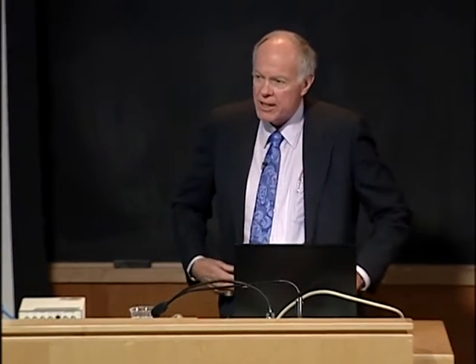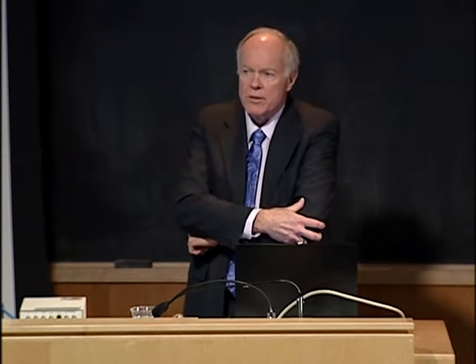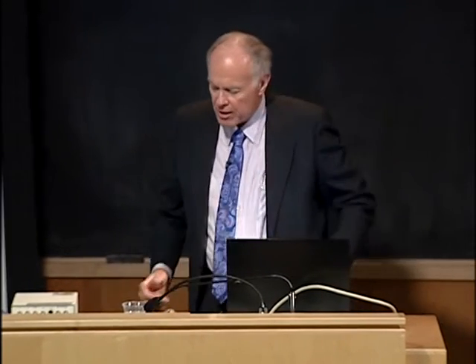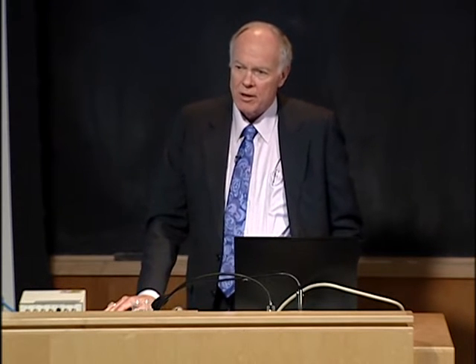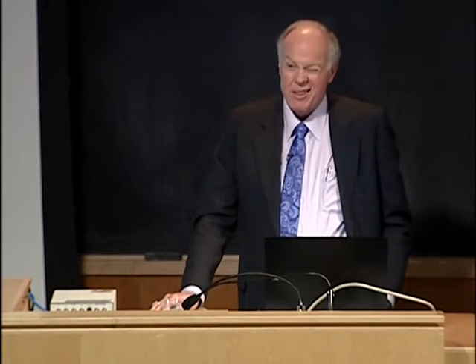This is what we want to talk about today. I was asked to talk about future laboratory automation, so I'm not going to show videos or photographs or slides about ARUP's existing automation. If you want to see that, there's a tremendous amount of information about it on our website, www.ARUPLAB.com. You have to do a little searching under technical expertise and then automation and you'll find it. There are a lot of videos you can play of our automated transport and sorting system, our automated storage and retrieval system, and the world's largest clinical laboratory freezer, at least I think it is. I couldn't get the Japanese to tell me how big their system is.